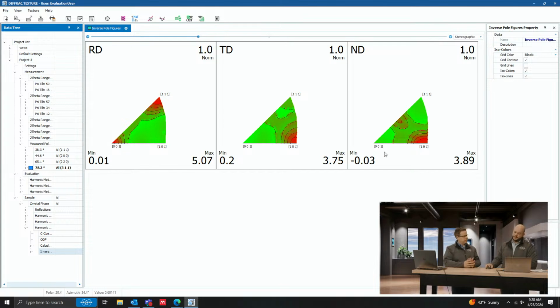If you add these together, this is basically where that stands. So this is the 112 if I were to just draw that here. It's just a different view of the way that this data is put together. This is used a lot by metallurgists.